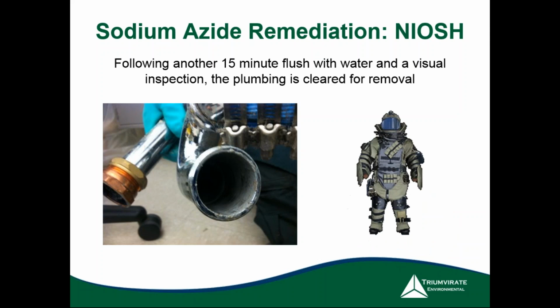And when we do removal, Triumvirate personnel do don explosion-proof PPE just as an extra precautionary measure, just in case, just to make sure that there's no explosions during the initial breaking of those fittings or the system. And then, like I said, a visual inspection is conducted, and that metal is considered non-hazardous.